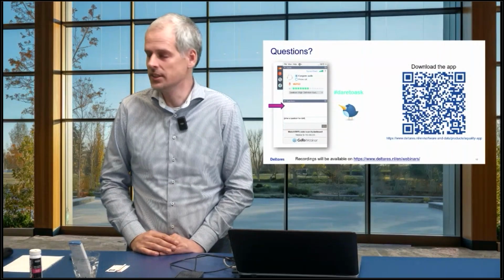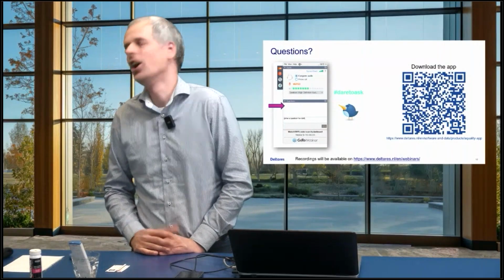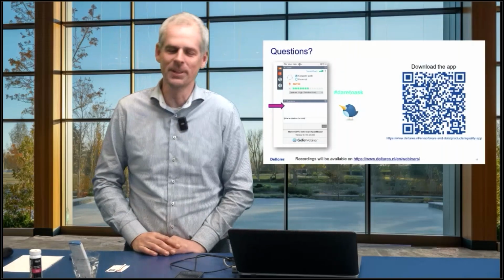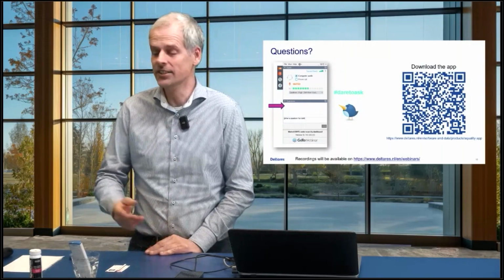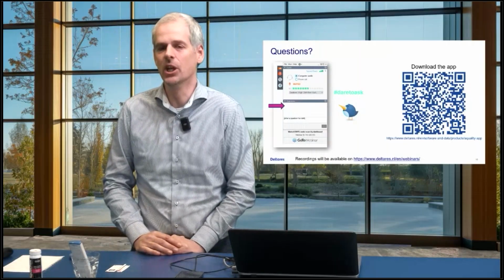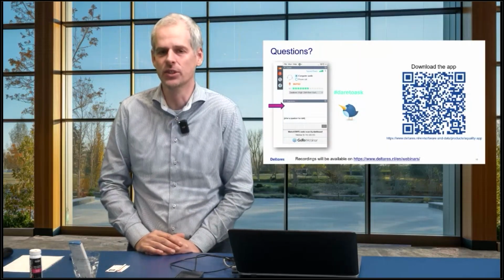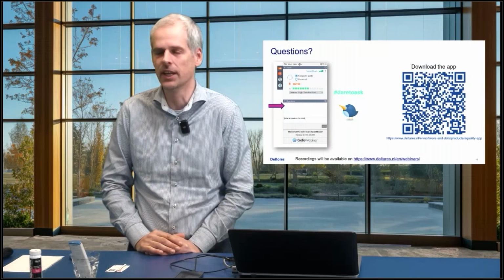The salinity. What a good result if it is what they're after, right? Oh well, zero is always nice, and well, not always for the farmer, by the way. Yeah. The salinity measures, they go very low. So also in rainwater, there's already enough salinity to measure with this device.